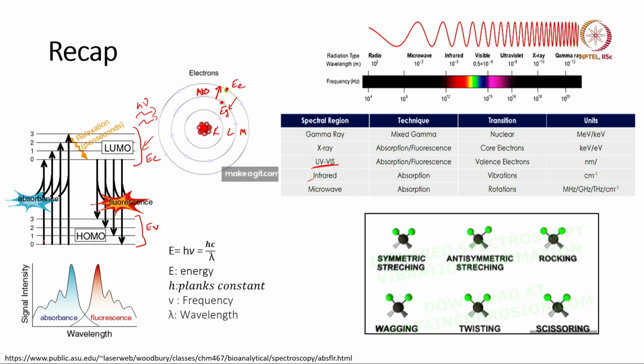The initial phenomenon where light is incident in the form of UV visible is called absorbance. Based on the allowed transitions, we get the typical absorbance spectra in UV visible spectroscopy. After certain thermal relaxations, the electron comes back to its ground state, or the valence band, and this phenomenon is called fluorescence. So, we get peaks in the form of fluorescence.